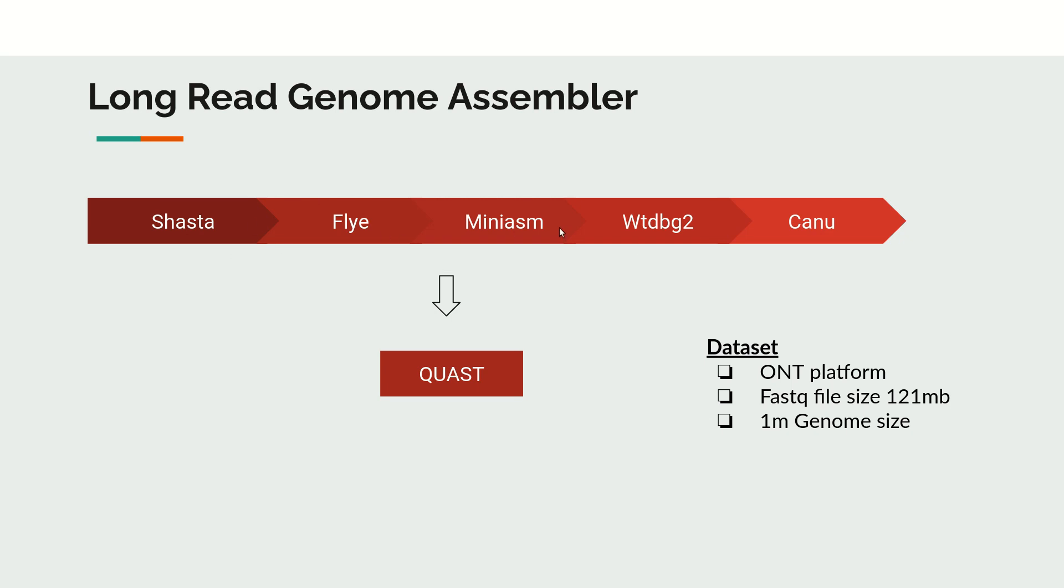At the end, we will compare all the assembly output results using QUAST. QUAST is an assembly statistics tool which will help us to see the various assembly parameters, and we can compare each of the tools in terms of total assembly size, NG50 value, and those kinds of things.